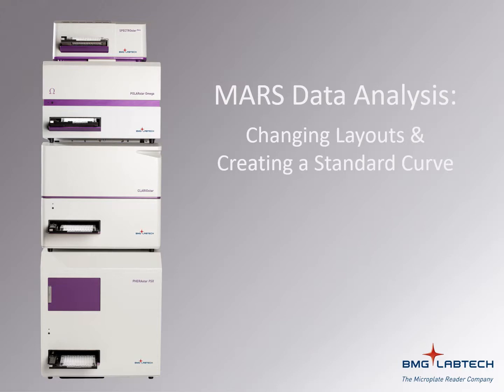Very often, you will need to perform data analysis sometime after you have collected your data. Fortunately, you can install Mars on any computer and perform data analysis at your leisure. Today, we will work with a dataset that only has raw data from a BCA assay. You will see how it is possible to change the layout to allow for standard curve calculations to be performed. Some other features will be addressed as we go along.